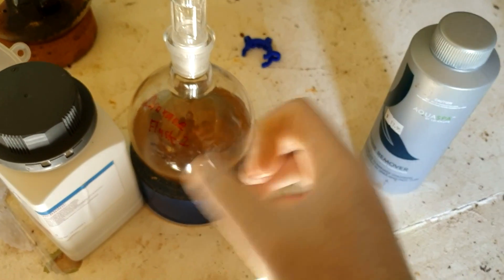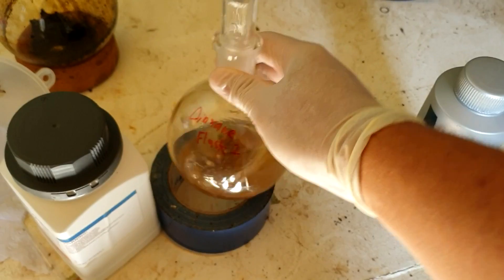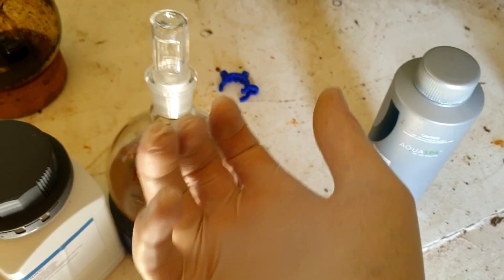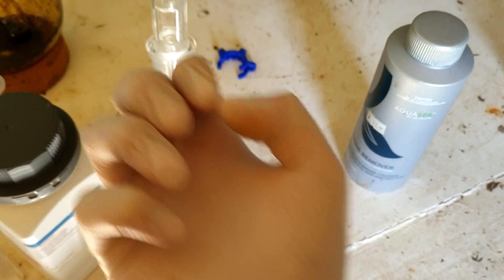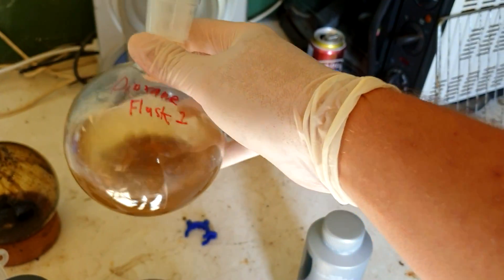So the molecular sieves — they're like a porous zeolite. They're an insoluble material that's very porous, and those pores are the size of water molecules. So the water will go into the sieves and leave the dioxane behind.